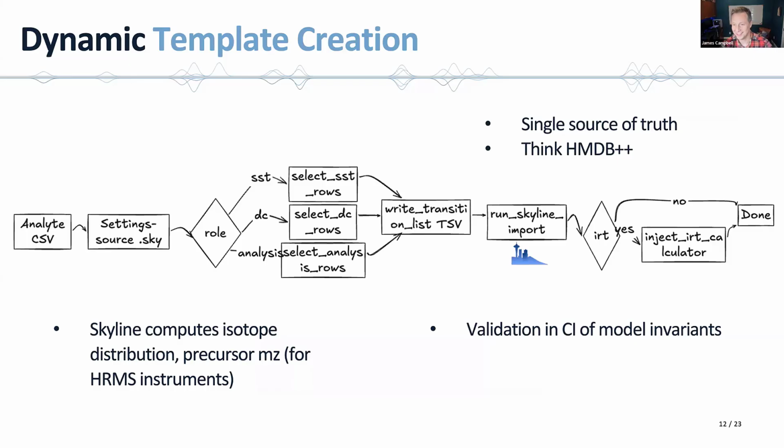One thing I'll just mention, in the spirit of this being an advertisement for the Skyline CLI, and also hopefully some tips and tricks, I find it striking that in this one single workflow, you get the parade of every possible data interchange format. So we start off with the CSV. Skyline prefers XML for their internal format, except when you're loading transitions, which are required to be TSVs, and iRT, of course, is inexplicably a SQLite database. We currently don't have a Skyline CLI option for building the iRTDB, so we just do that manually.